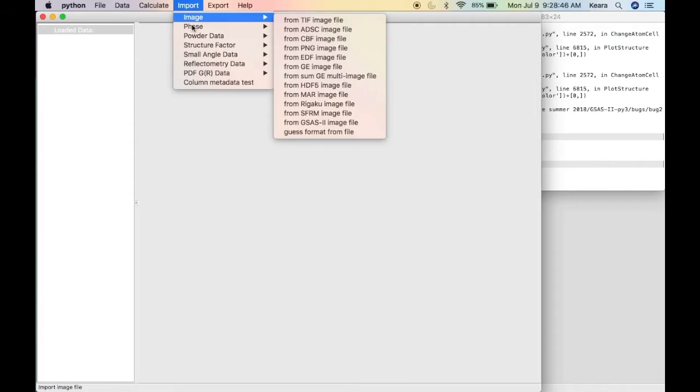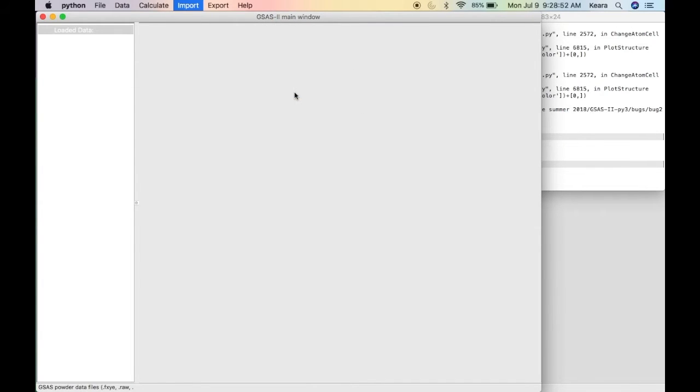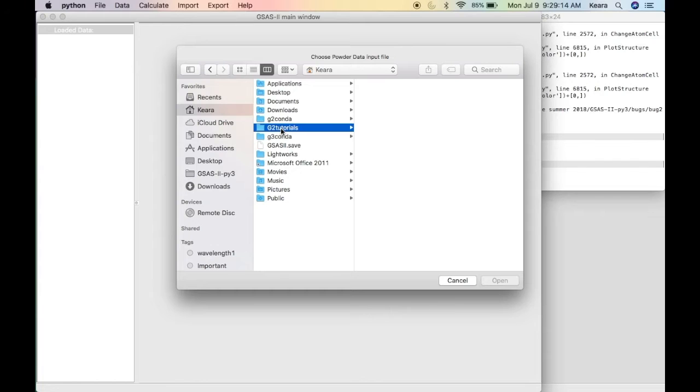At the top of the window, go to Import Powder Data from GSAS File to read the data file into GSAS2. This read option is set to read any of the powder data formats except neutron TOF time map files. They are defined for GSAS with the angles in centidegrees. Find the file directory, CWNeutron, and go to the data file to find the file.